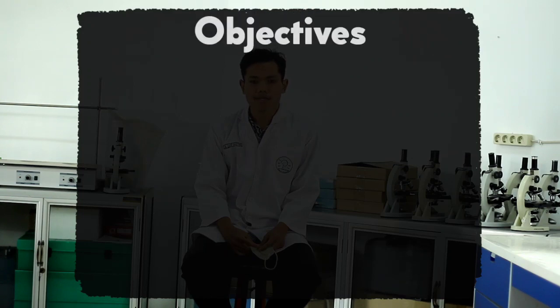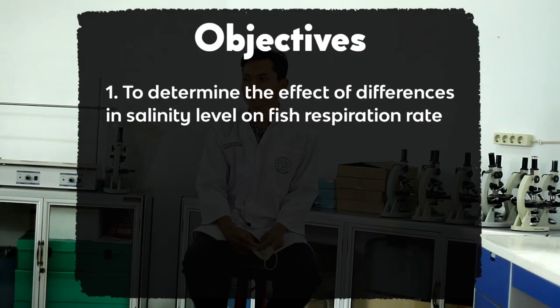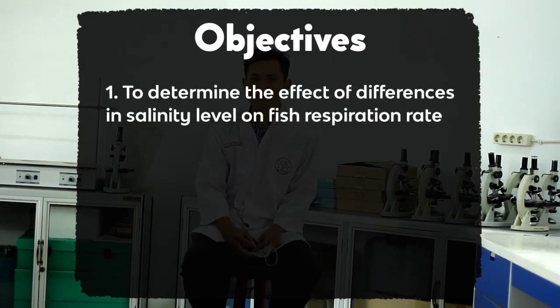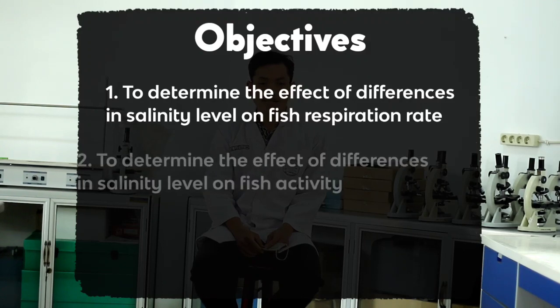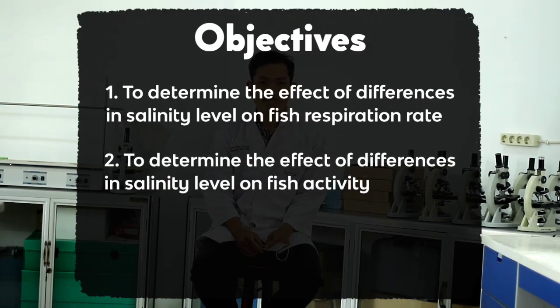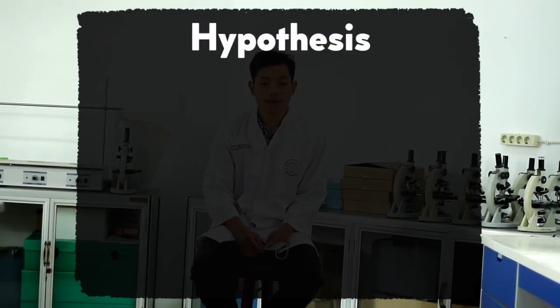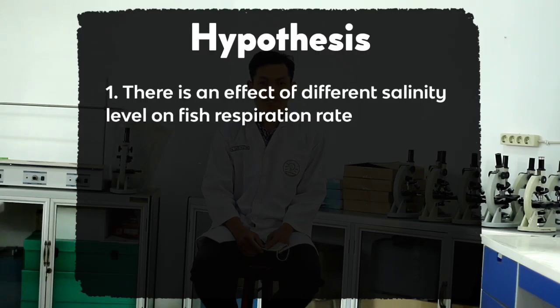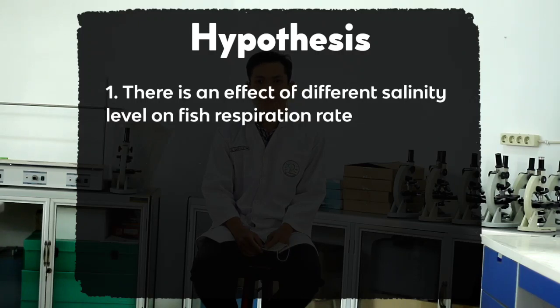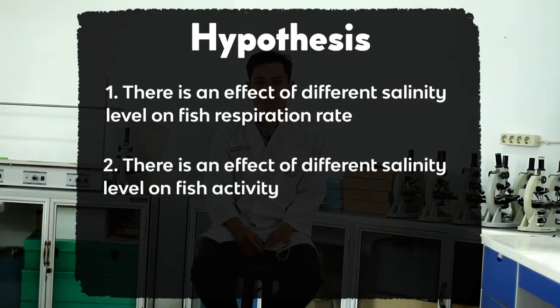The objective of this experiment is: one, to determine the effect of differences in salinity levels on fish respiration rate, and two, to determine the effect of differences in salinity levels on fish activity. The hypothesis is: one, there is an effect of different salinity levels on fish respiration rate, and two, there is an effect of different salinity levels on fish activity.